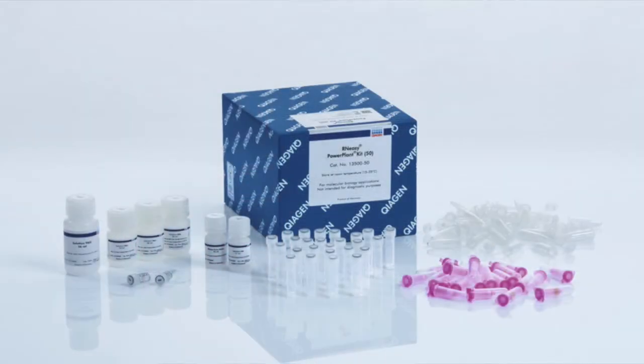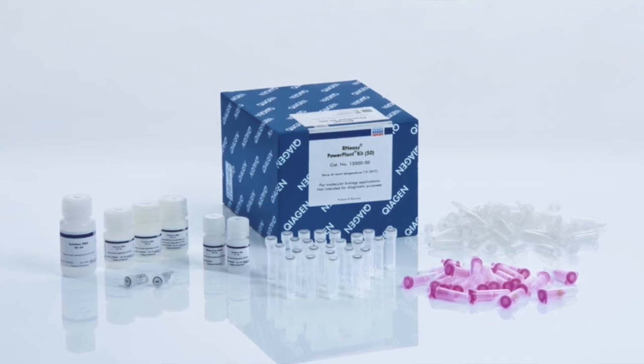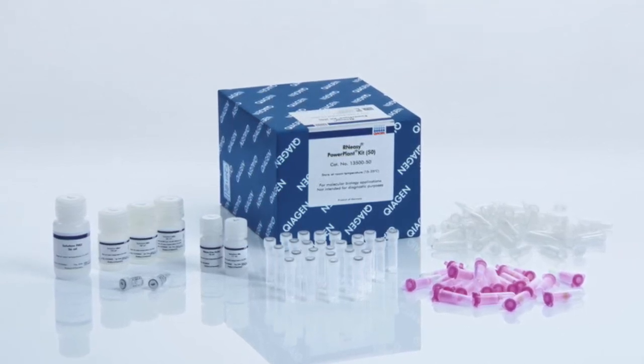Okay, so the other common approach is to use commercially available kits, usually spin columns. So these usually involve some sort of proprietary sample and lysis buffer, the principal component of which is often the same. It's usually guanidine isothiocyanate.